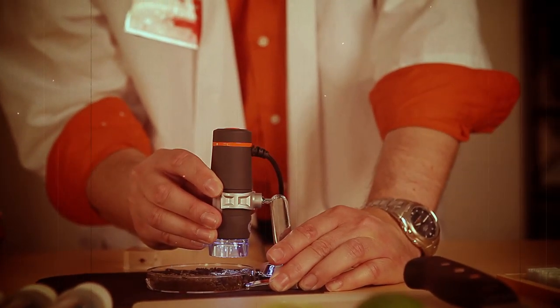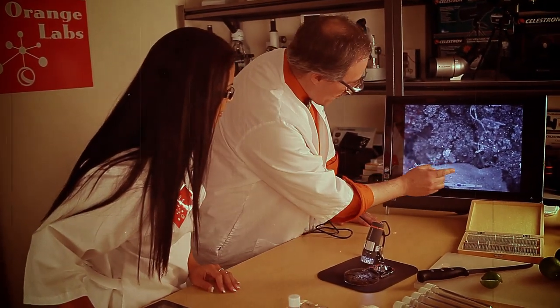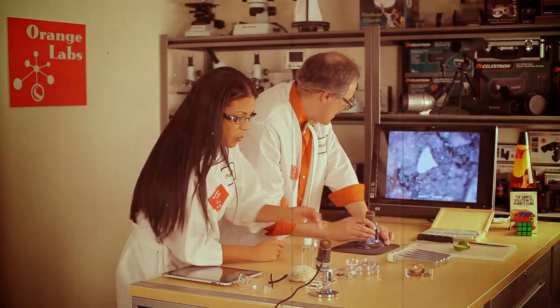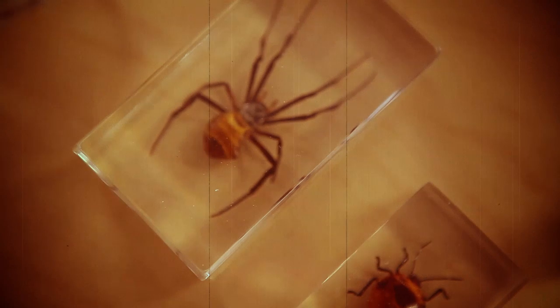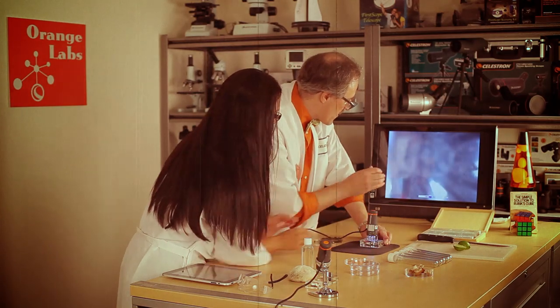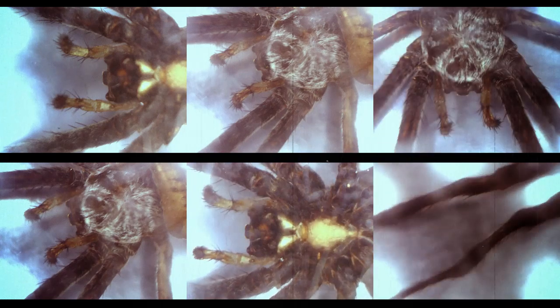I can't wait to get this on my Facebook page. If there were insects crawling around in there, we could use the record video button to actually record them as they walked around on the screen. It actually takes video? Yep. Why don't we try the spider? Wow, he's even bigger. Look at this — with the nifty measuring software that comes with this microscope, I can even do measurements. Let's see how far his eyes are apart. That's amazing. Look at the size of those legs — you can see all the hairs and tendrils.